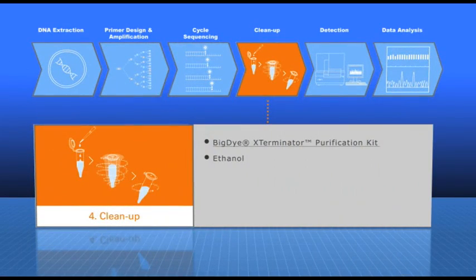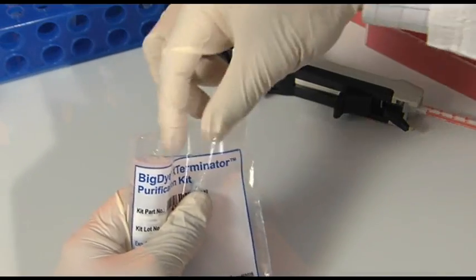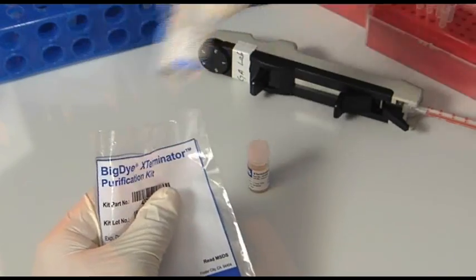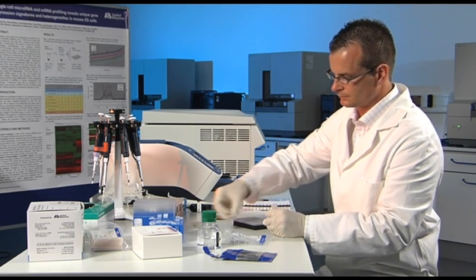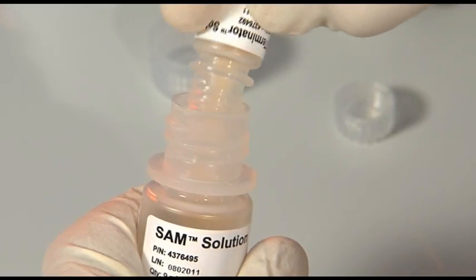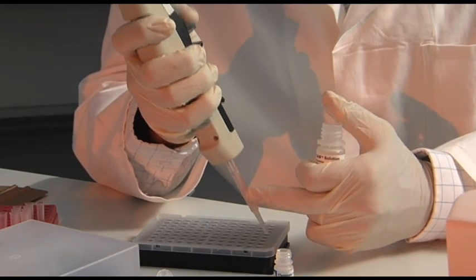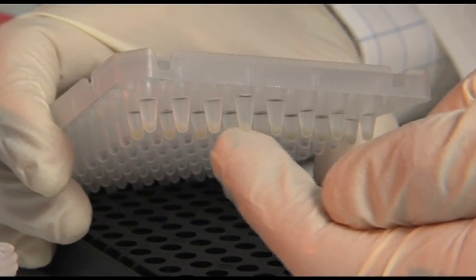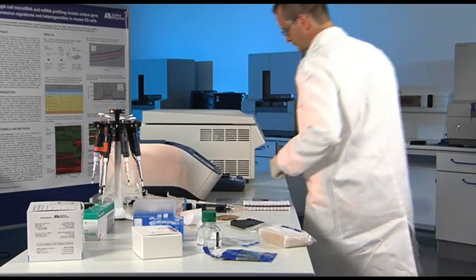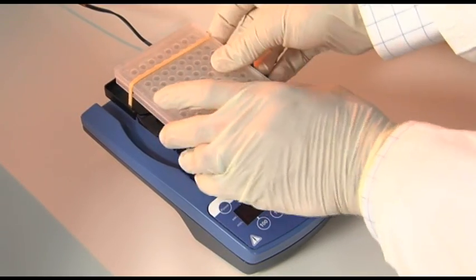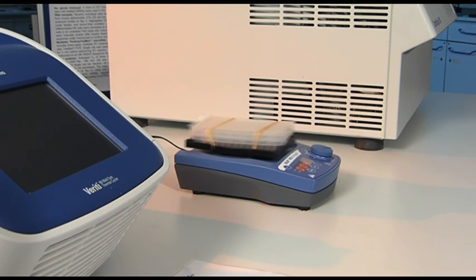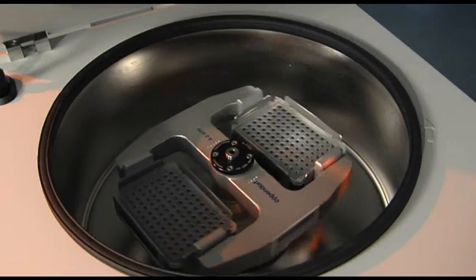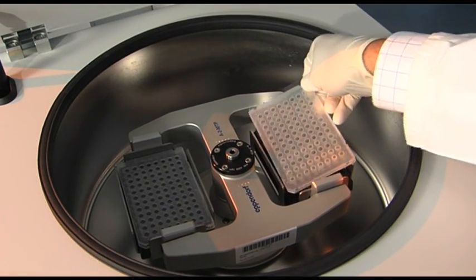Clean-up: An excess of fluorescent labeled dideoxynucleotides and salts is then effectively removed in a purification step using the BigDye XTerminator Purification Kit. The reagents are pipetted directly into the original sequencing plate. The plate is sealed and thoroughly shaken for five minutes on the vortexer and centrifuged briefly before electrophoresis. Usage of the BigDye XTerminator Purification Kit leads to clean sequences with high signal intensity, often resulting in longer reads with higher quality.